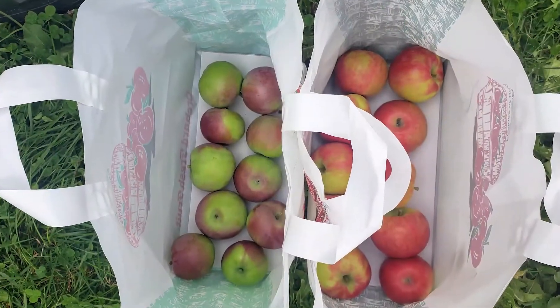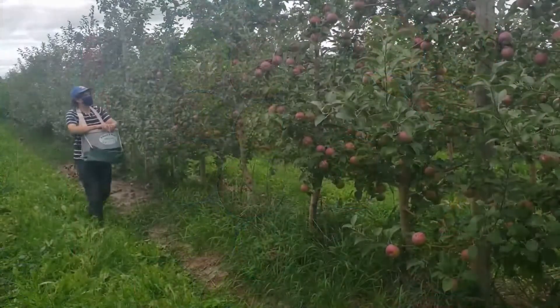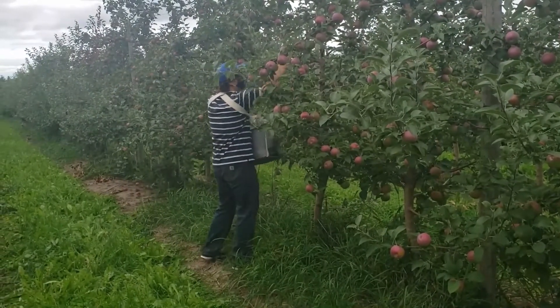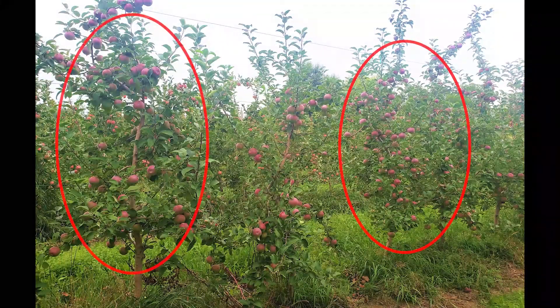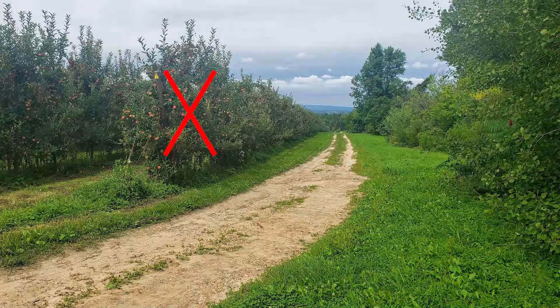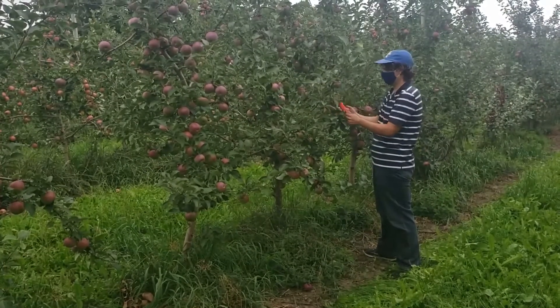You will need to collect a representative sample of at least 10 apples for each block and variety you're interested in testing. Sampling should be conducted once or twice per week, beginning at least three weeks before your expected harvest date. Select trees that are representative of the block in both crop load and tree vigor. Avoid sampling from trees at the ends of rows or from outside rows.